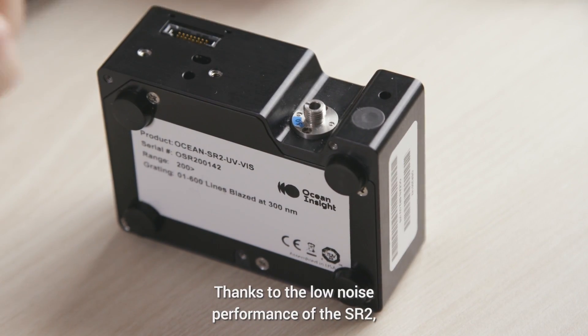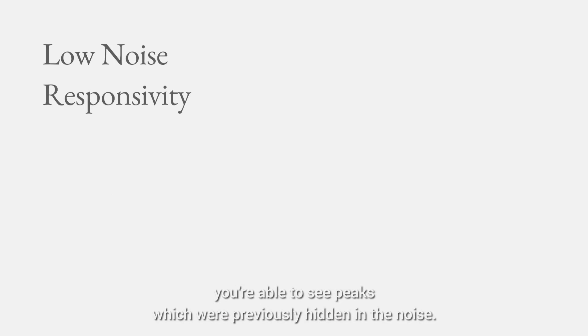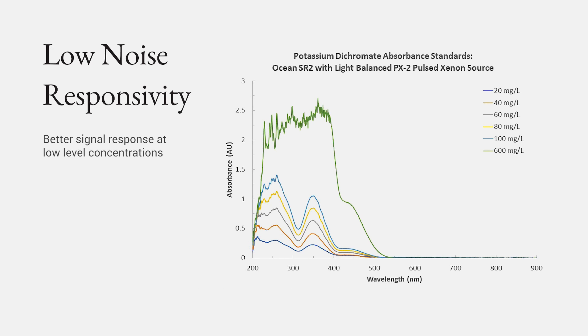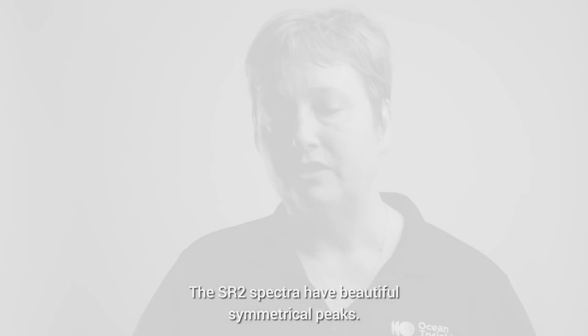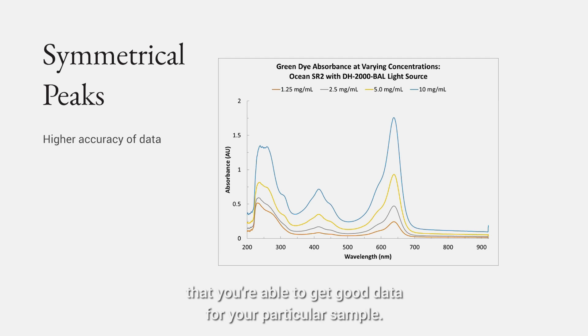Thanks to the low noise performance of the SR2, you're able to see peaks which were previously hidden in the noise. This means that you're going to improve your detection limits so that you can get down to lower levels, maybe even trace level concentrations of your sample. The SR2 spectra have beautiful symmetrical peaks, and those narrow peaks are going to be very helpful to ensure that you're able to get good data for your particular sample.